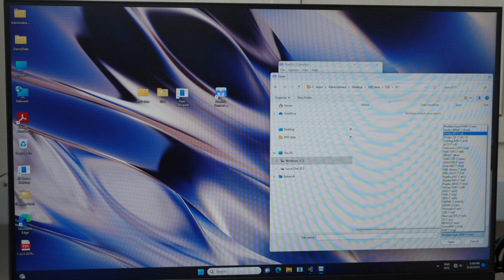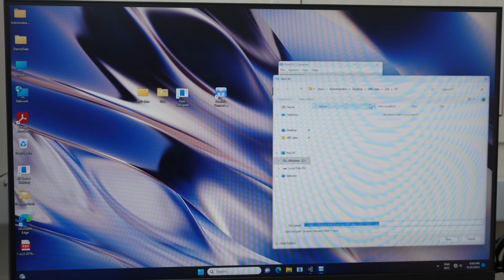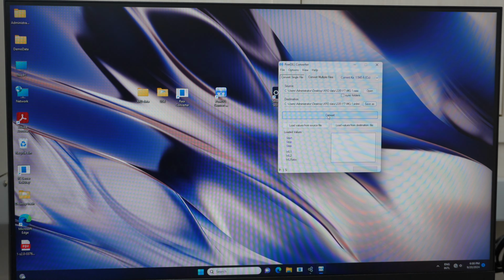Here we will try to change this one to convert to .xrdml. Then press the convert button. So basically, this converter is also very helpful in order to combine data from another analysis using different software or different machine. Okay, now we move to the second sample.